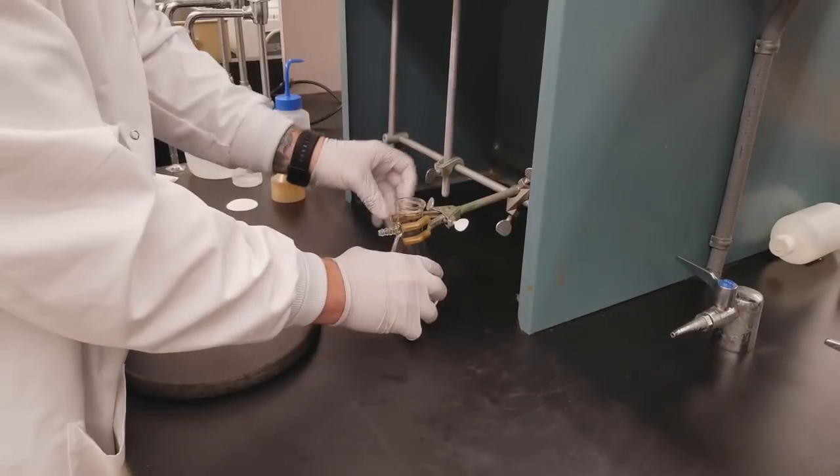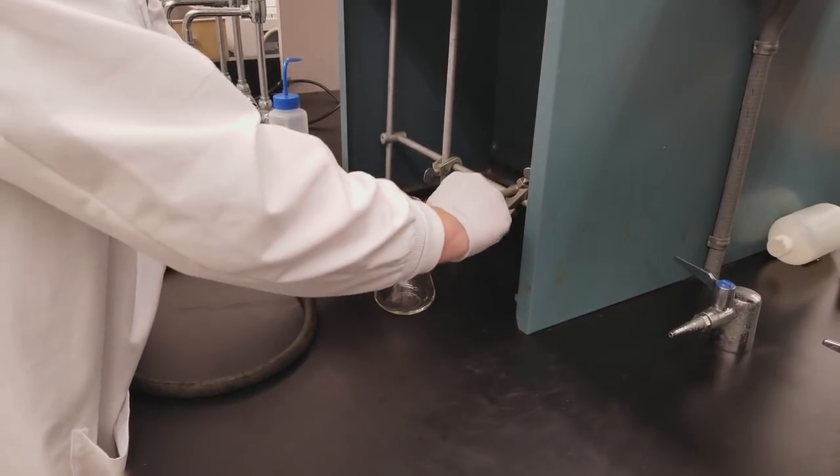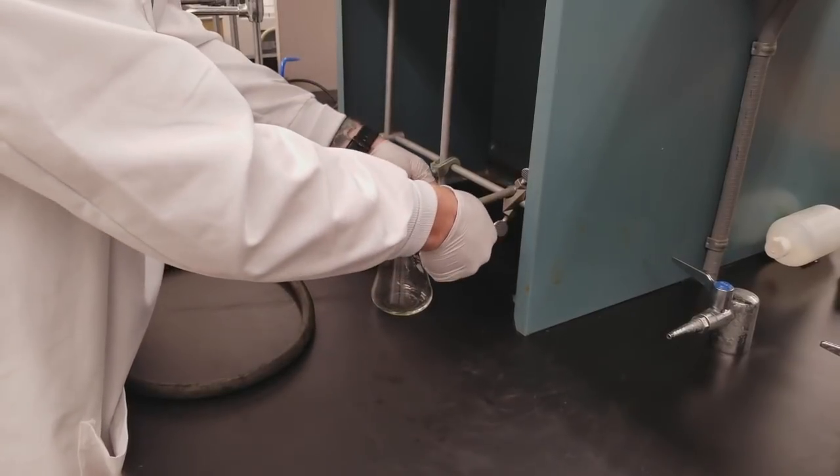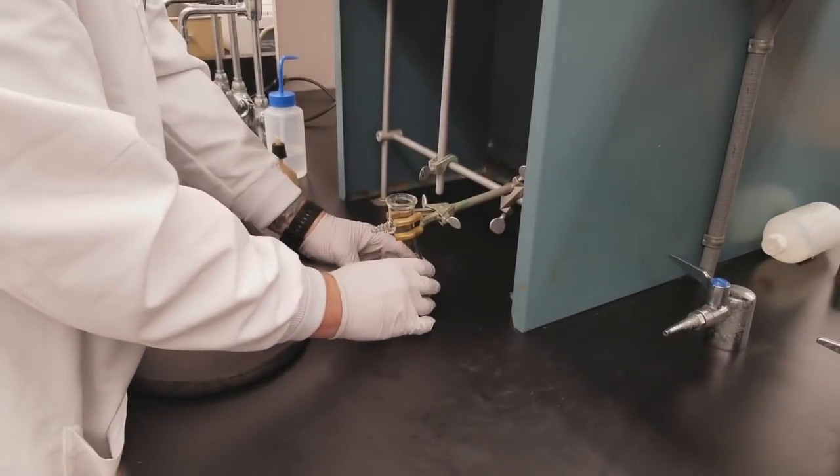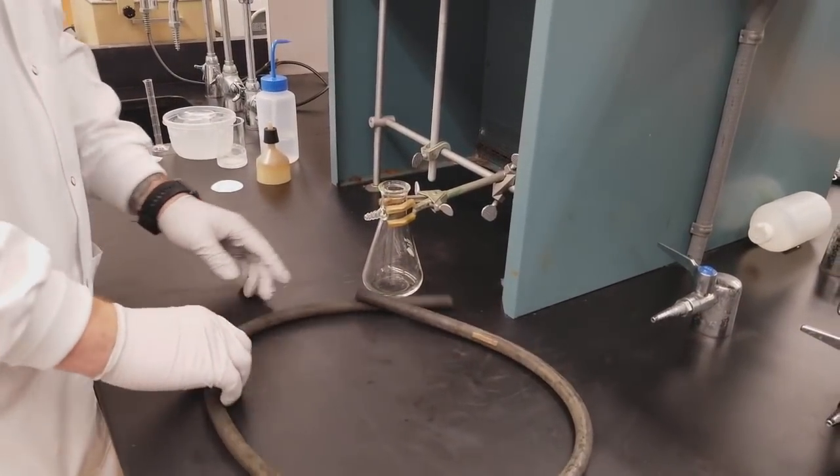Now we're going to put our vacuum filtration flask into the clamp, tighten that up, and now we can go ahead and attach our vacuum tubing.